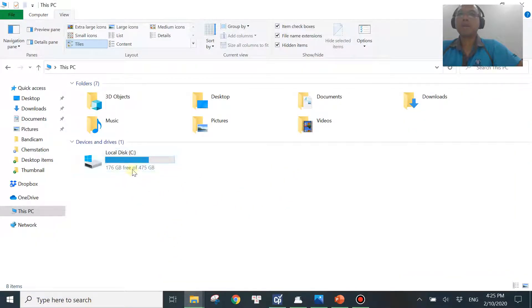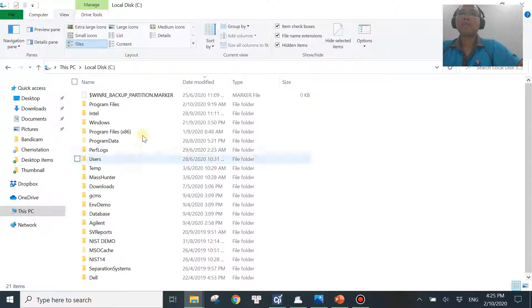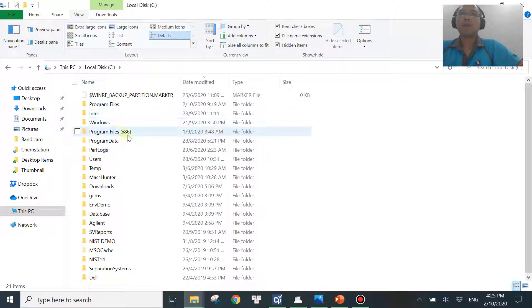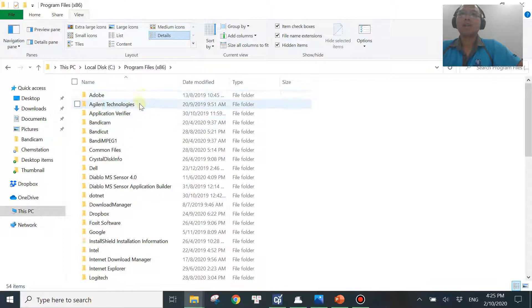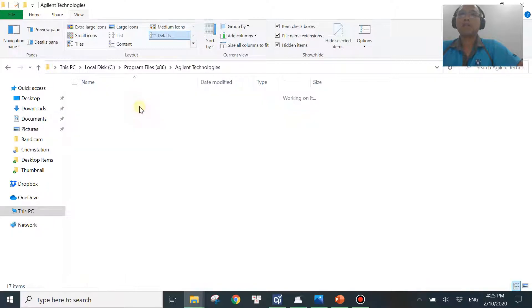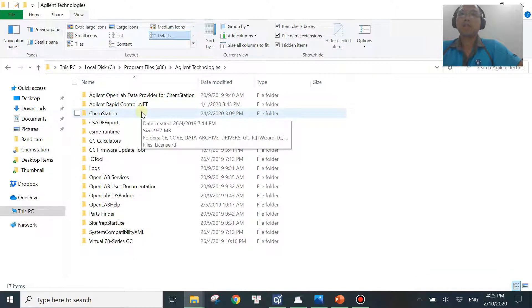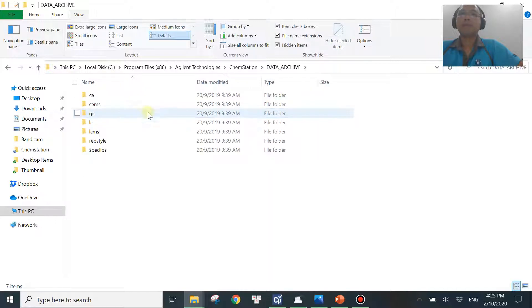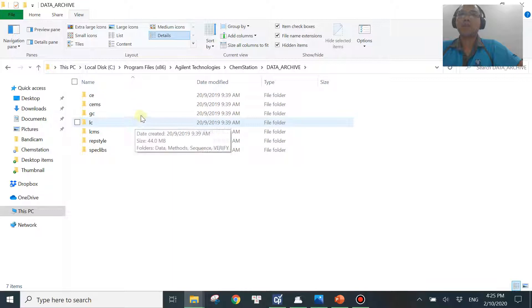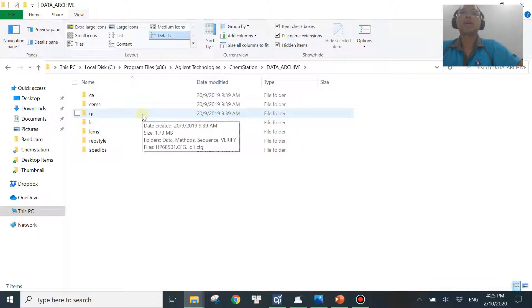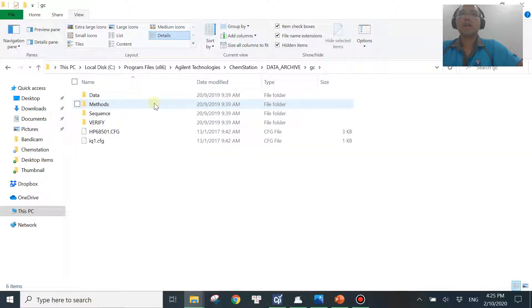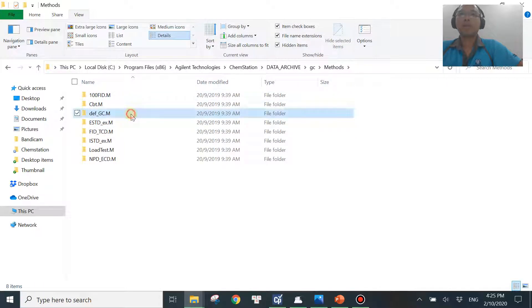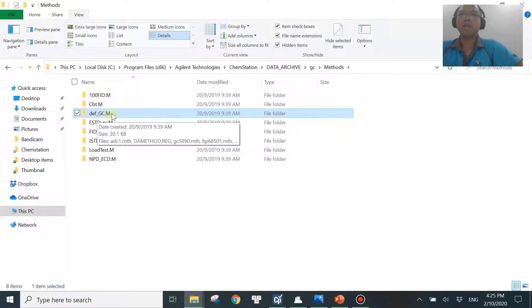Go to the C drive, then Program Files (x86), then Agilent Technologies, then ChemStation, then Data Archive, then GC or LC depending on which instrument you are working with. Then go to GC and then Methods.